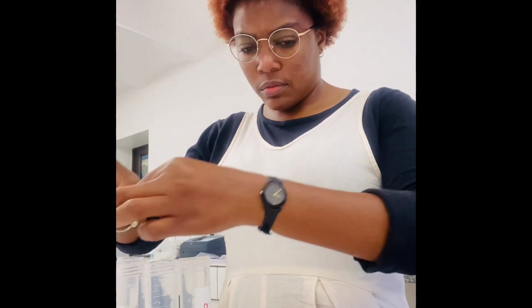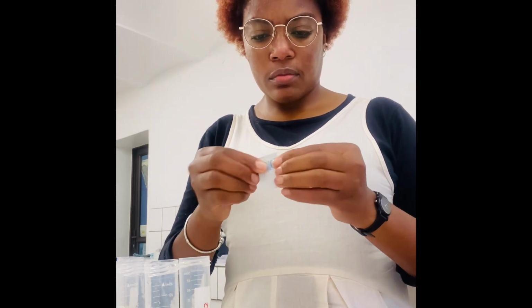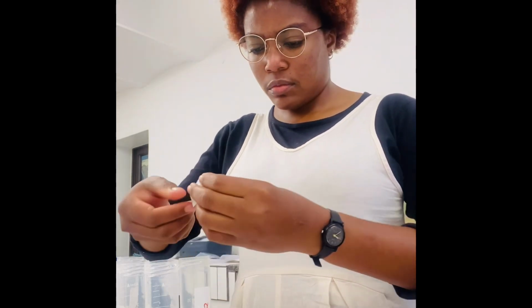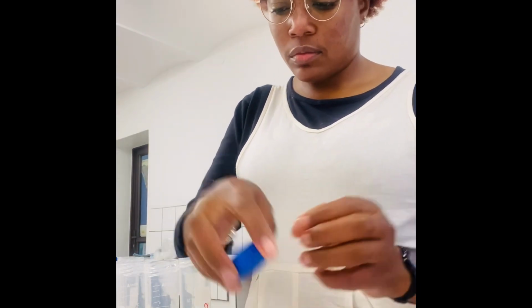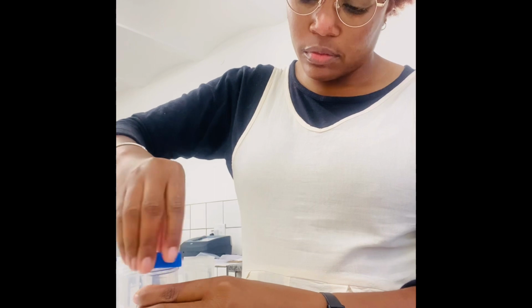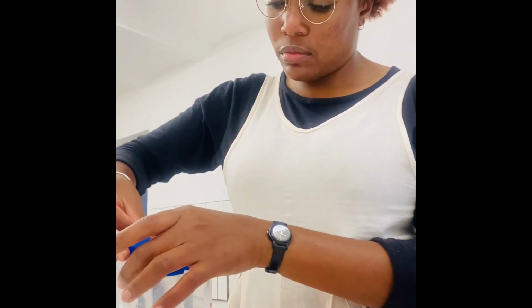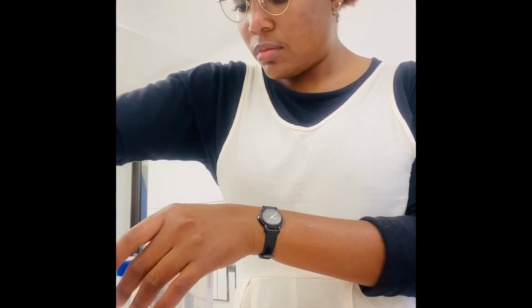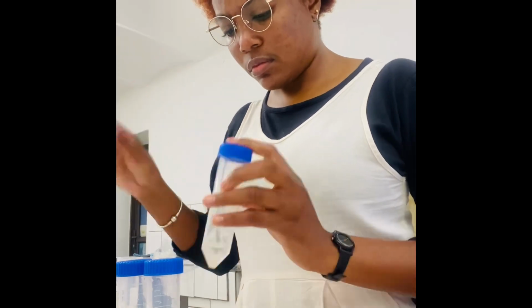One needs to redo it if you just miss a step, or if a small drop of different water can already contaminate the sample. It needs to be treated with care, not unlike me who's not even using gloves. The older way, one really needs to use gloves, and it was just time consuming. And once you don't get the results that you want, you need to redo it again, and it will take like the whole day basically.